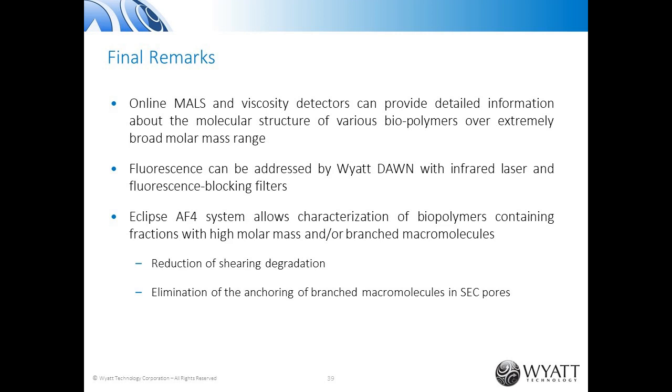Once again, what are possible solvents for AF4? Okay, so for AF4, we can use aqueous buffers. That is many times the case for polysaccharides. We can also use organic solvents. THF works very well, and it also dissolves many polymers. Other solvents that can be used include dichloromethane, chloroform, toluene.